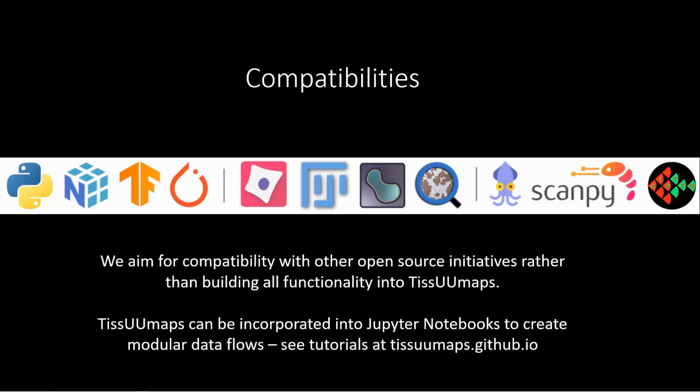So there's a question in the chat that maybe relates to this, which is, are you planning on integrating OME-Zarr as a supported format? That's a very good question. We are thinking about it. The problem is OME-Zarr is evolving quite fast. There is a lot of work on NGFF and other kinds of formats to incorporate more objects into one format.